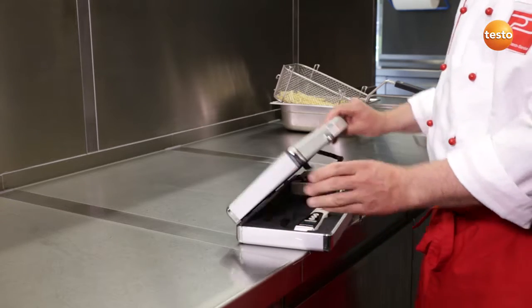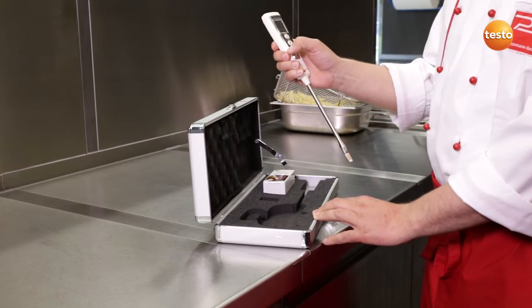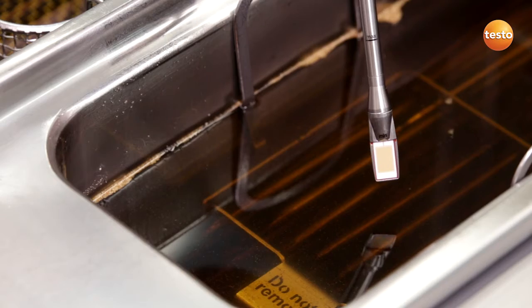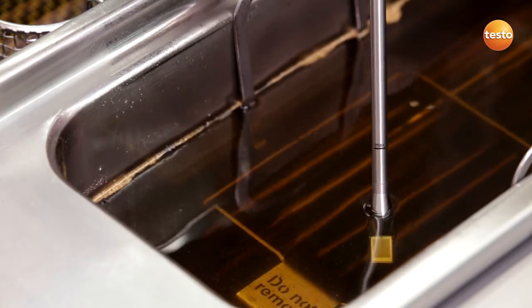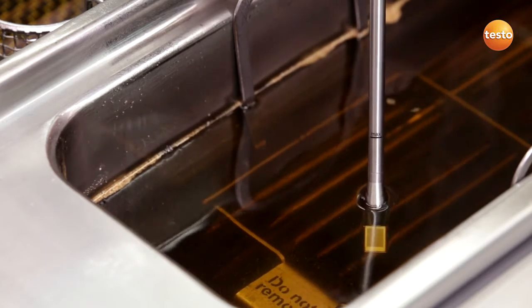This is my Testo 270. I switch it on and it's ready for use. I can't begin measuring until there are no more bubbles rising up out of the oil, because then there's no water in there either. It's important to make sure the plastic parts don't come into contact with the hot oil, and also to maintain the minimum distance of one centimeter between the sensor and any metal parts.